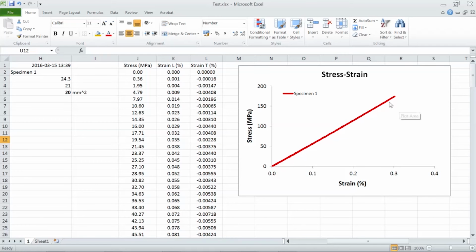There's no deviation, no damage. It's very linear, goes up, and it returns on exactly the same line. Well, maybe there's some scatter, but very, very little. So it's really a nice material in the sense that there's no non-linearity and no damage. And there's no damage because we only loaded it up to 0.3 strain, which is very low for a composite. So we can obtain the initial stiffness of the material with no damage.